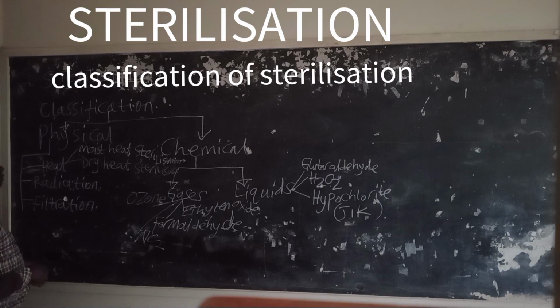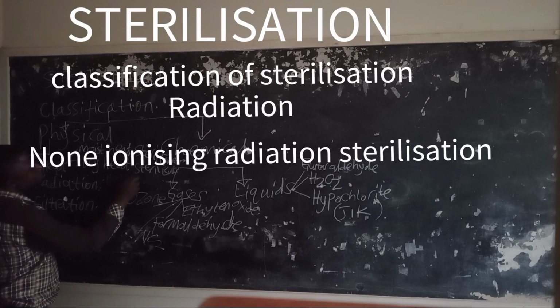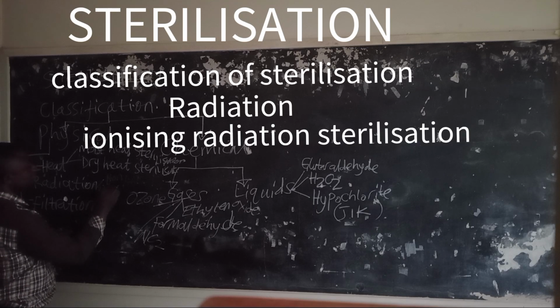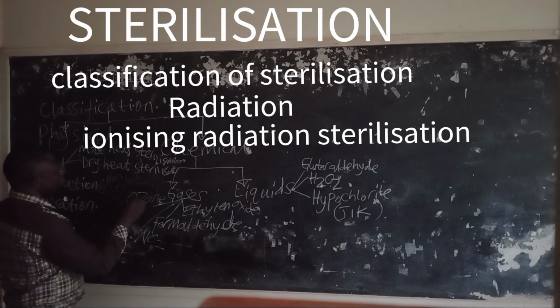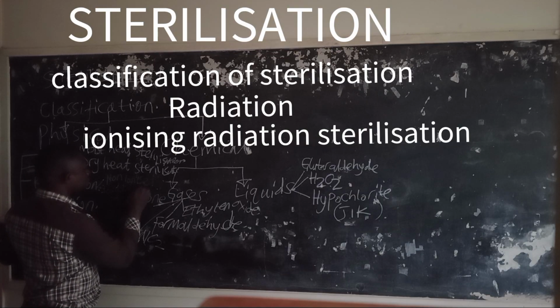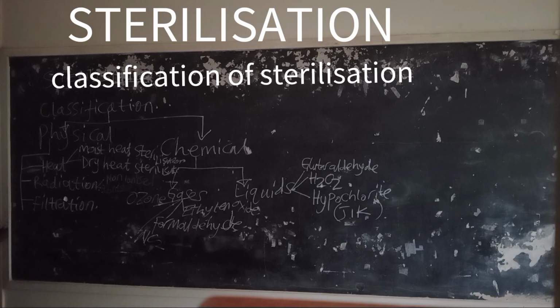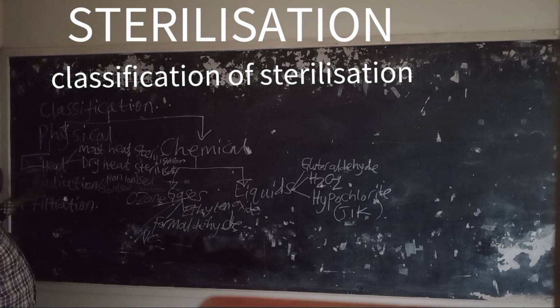Then we also have radiation. Under radiation we have non-ionized and ionized radiation sterilization.